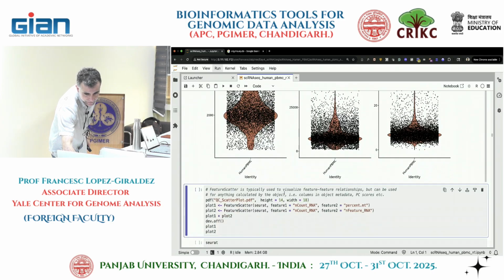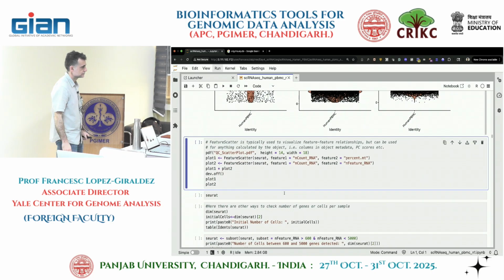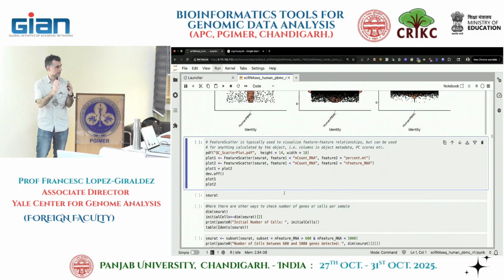So this is in the plot. The bigger area means this is the mean. That's a density. The red shape below shows how dense the dots are in that area, because if you plot the dots only, it's hard to tell how dense it is. You see a lot of dots, but you need something else to help. They're plotting exactly the same thing. One is the density plot, the other is just the dots.